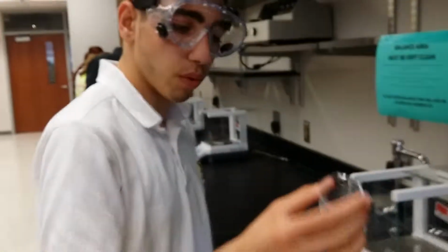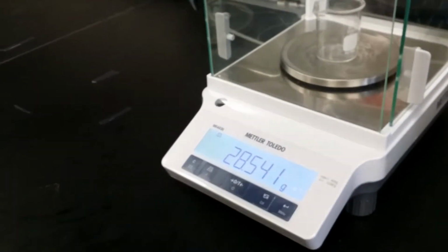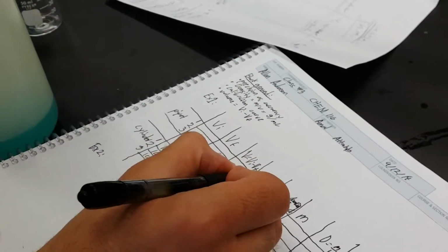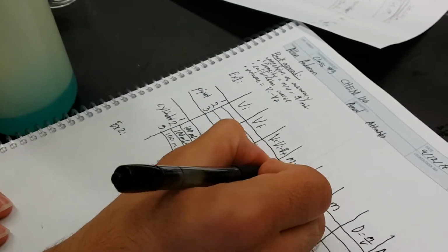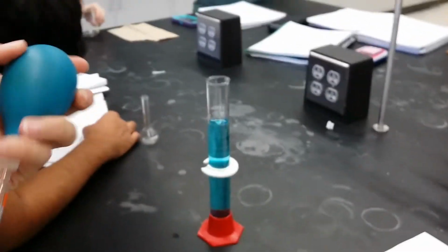Alright. So first thing is to weigh the beaker before you put any liquid in it. And the weight is 28.541 grams. Then you just take out 10 milliliters.